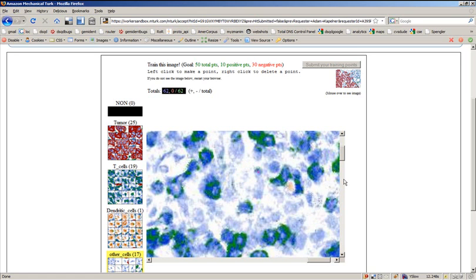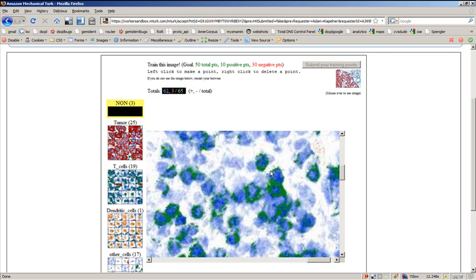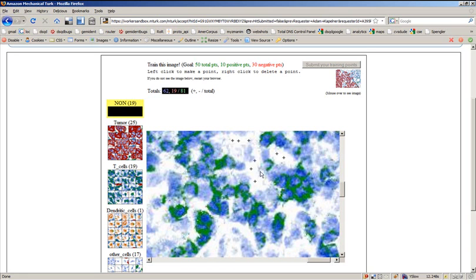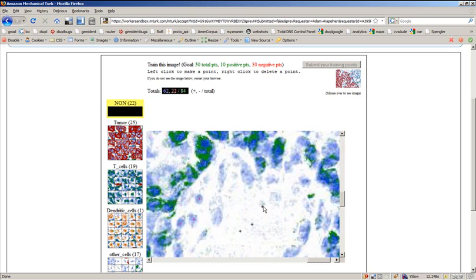That's enough for now. Let's do some nons. Nons are everything but the phenotypes, including the background. It's a little bit close.